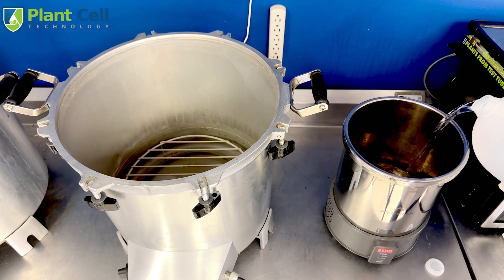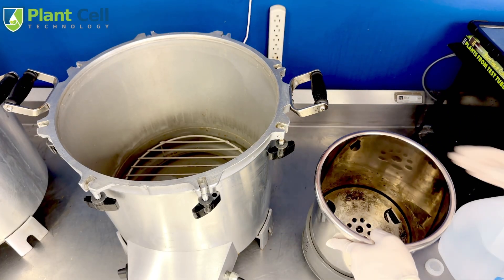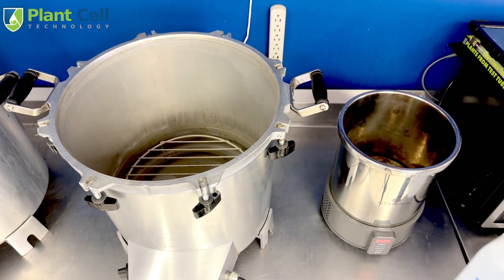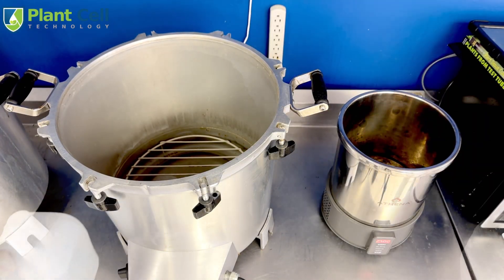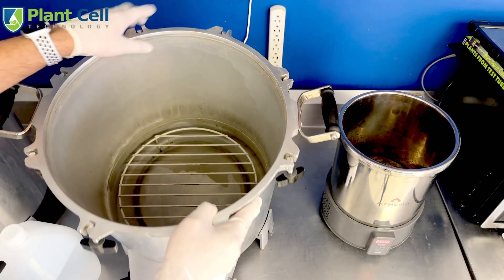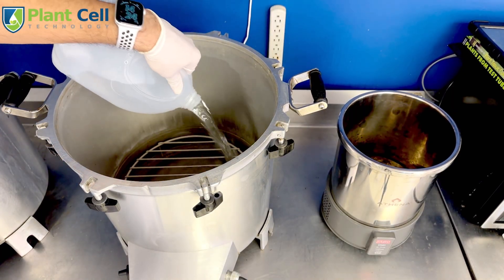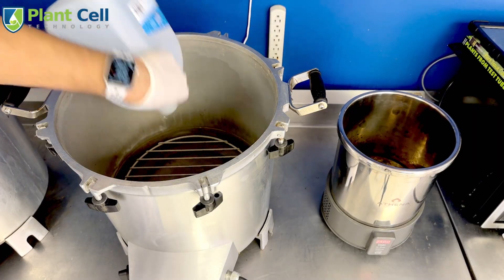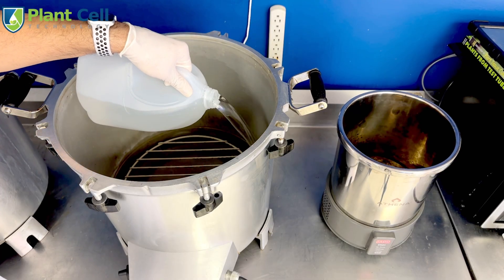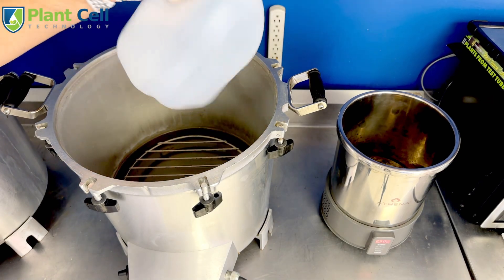The reason is the size difference and the amount of water they require. The Athena only requires less than a liter of water — you fill the water all the way to the bottom tray. For the All-American I do the same thing; it has a bottom tray and a marking on the side, so I fill the water to that mark. That takes this full gallon plus an extra one — just under two gallons of water to fill the All-American.